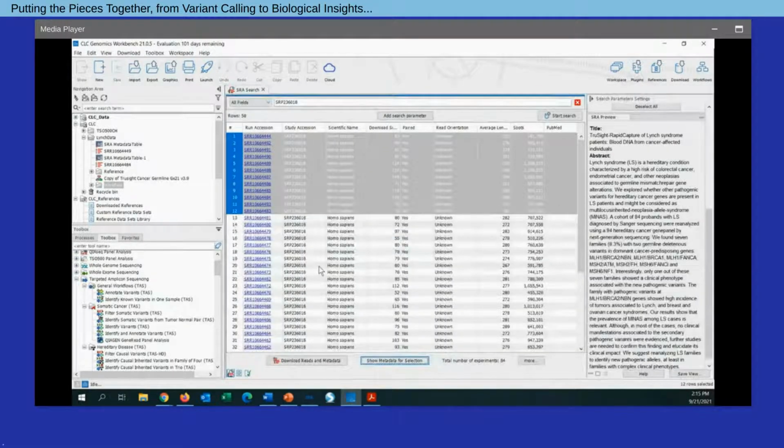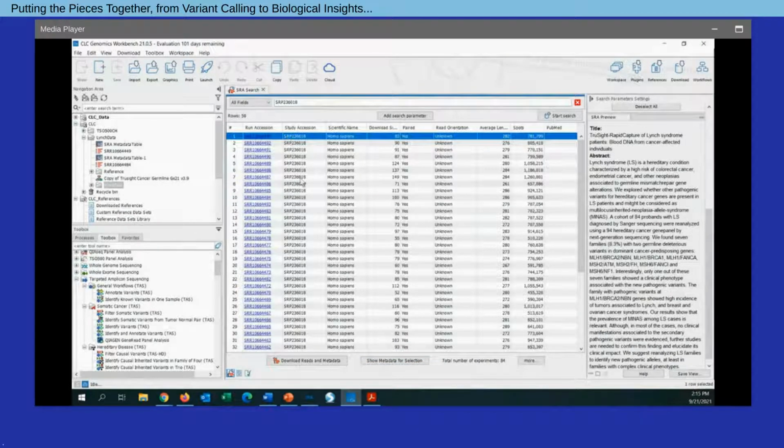Now, for any sample of interest, I would have the ability simply to select that sample or select multiple samples and simply click Download Reads and Metadata here. And that will get the data directly into my software. So there's no need to move externally to capture my sequencing data from a public repository.